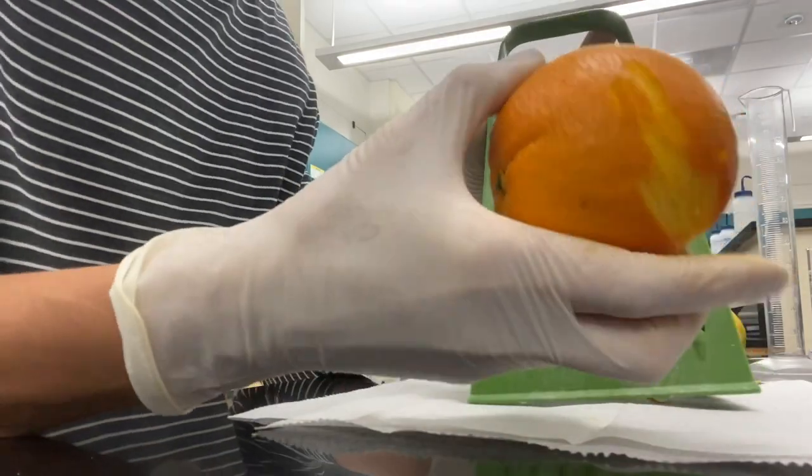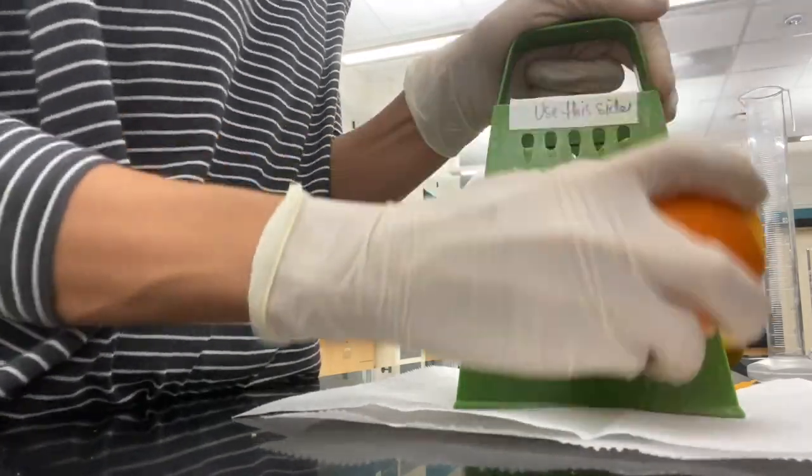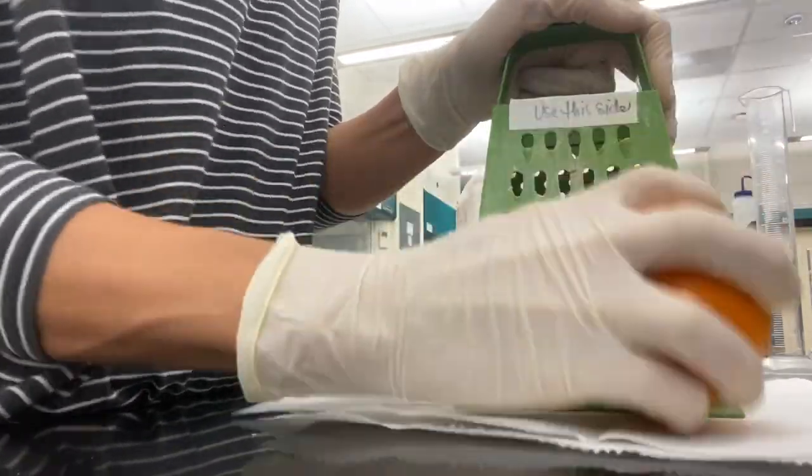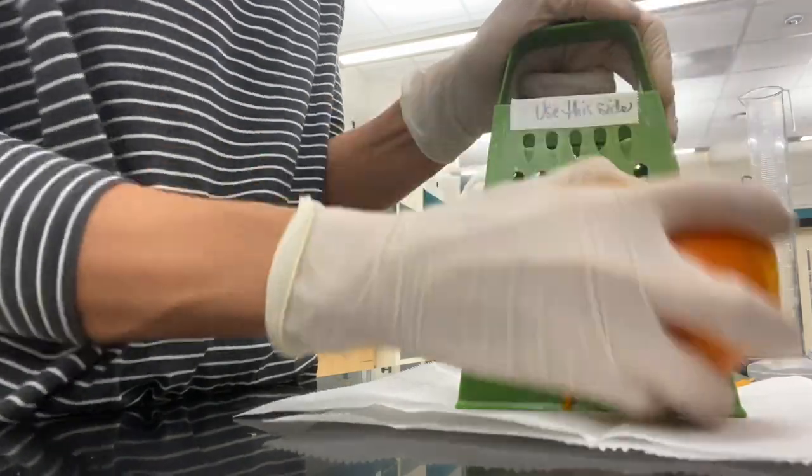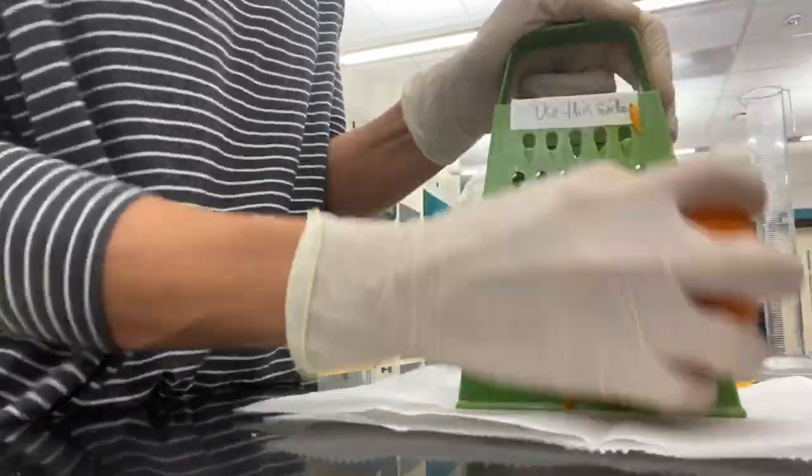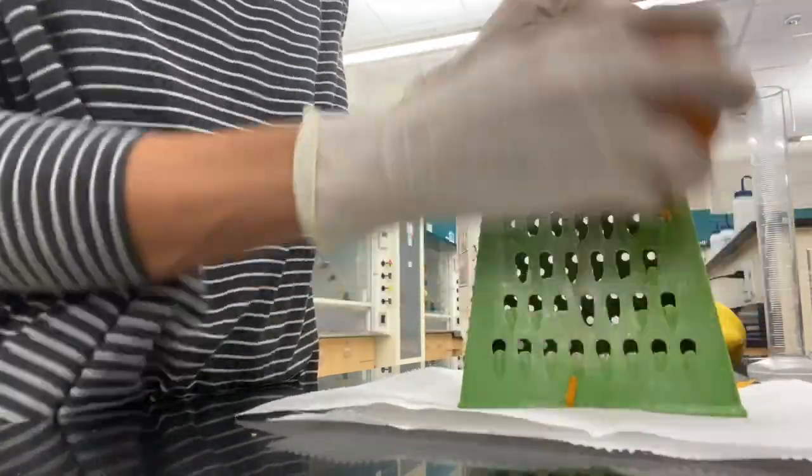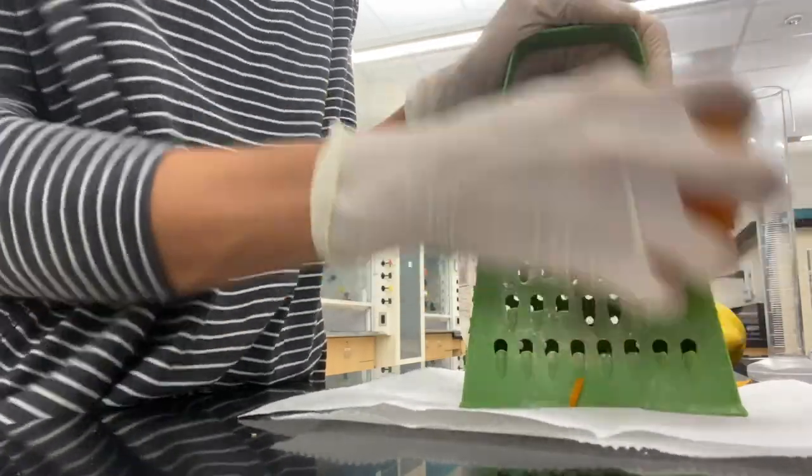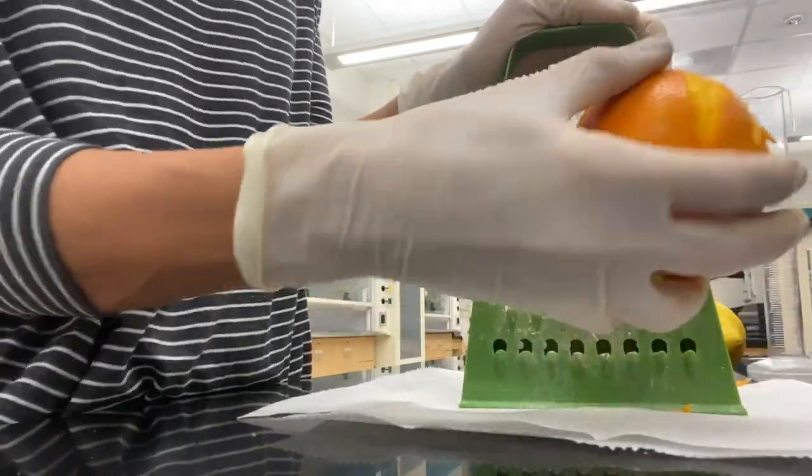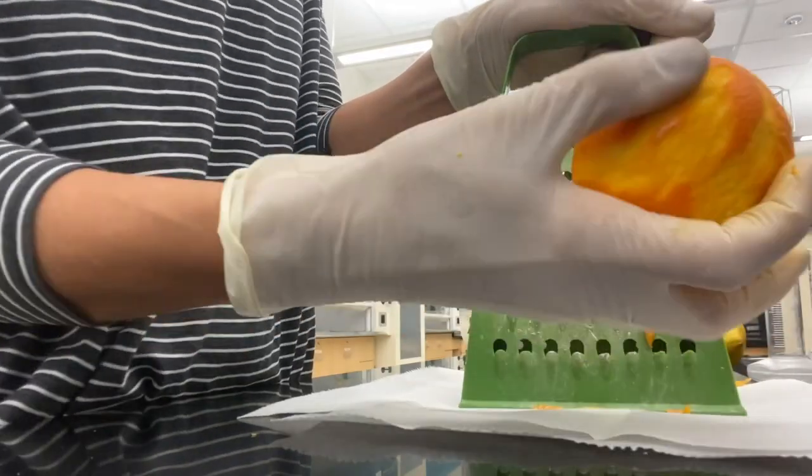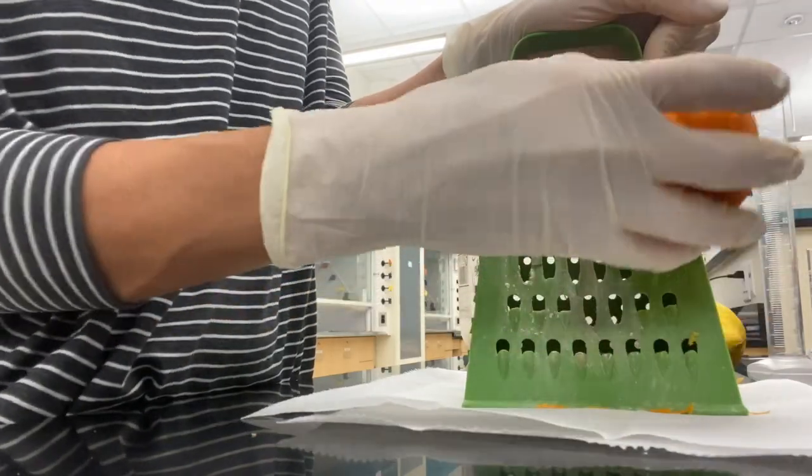The first thing we need to do is the fun part. We're going to use this big grater and grate off some orange rind. You see that I'm just getting off the orange part, not grating so much that I'm getting to that white area. Most of that limonene is going to be found in the orange of the orange rind. I want roughly three grams.